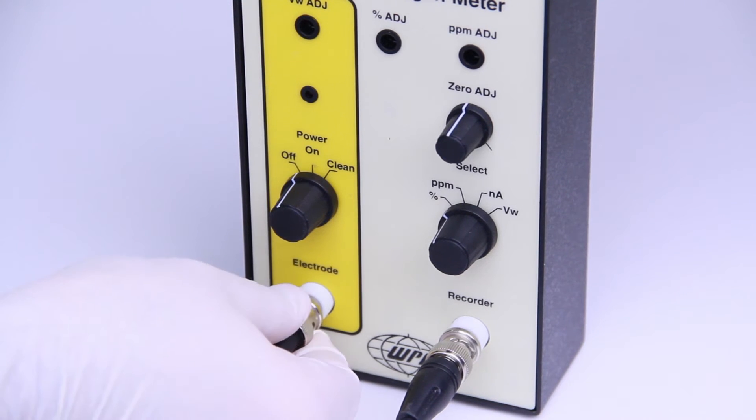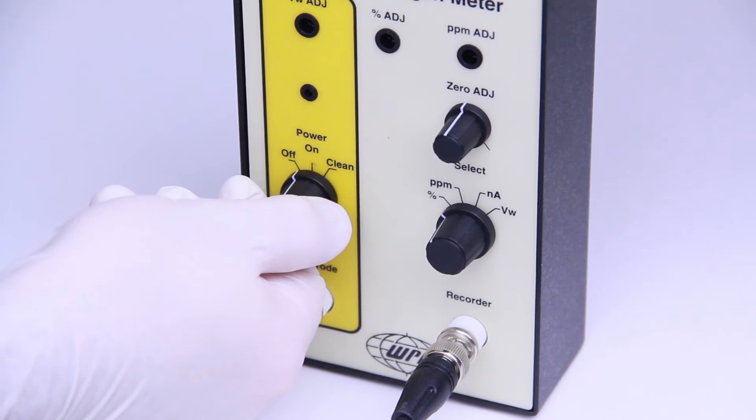On the iso-2, set the select switch to nanoamps and the power switch to on.